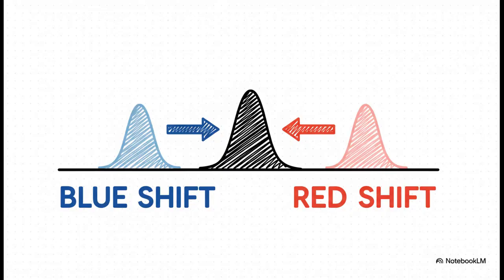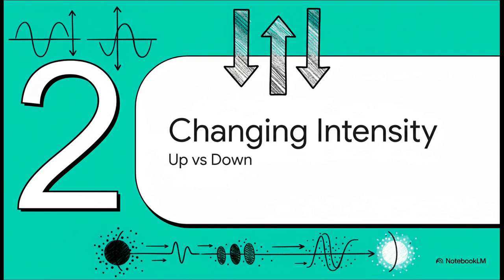Okay, let's lock this in. When we're talking about color shifts, a bathochromic or red shift is a move to longer wavelengths. That's to the right on our graph. A hypsochromic or blue shift is a move to shorter wavelengths, a slide to the left. Got it? Awesome.